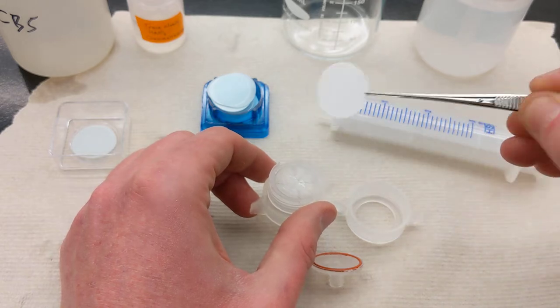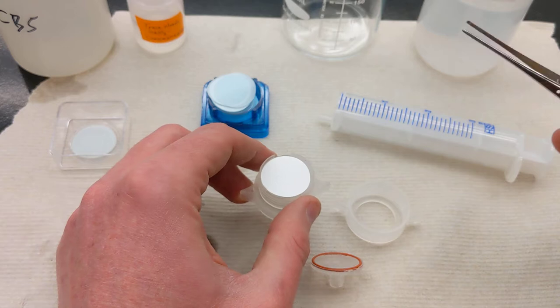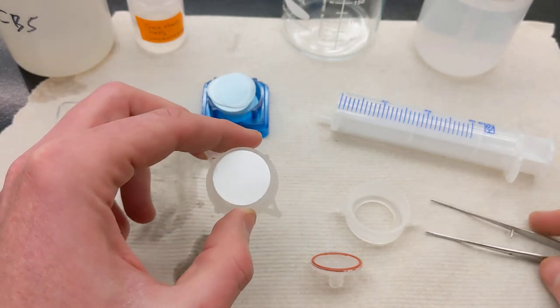Take this filter. If it's the same on both sides, it doesn't matter, there's no directionality. If there are grids on one side, then the grid face goes up. You'll just place that in here.